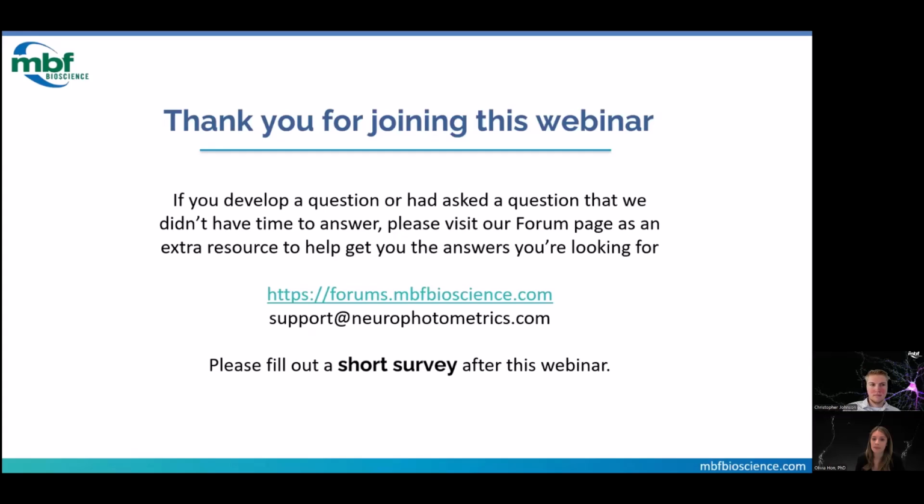So we do have one other technical question. Is it possible that the linear fit that you guys are estimating from the isosbestic signal may affect normalization of the peak? Sorry, I might have gotten that question a little wrong. If Syed, you could maybe clarify a little bit more. But are there any issues, I guess, that you could see with this linear fit? Like say there was a big motion artifact there or something.